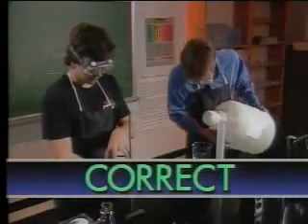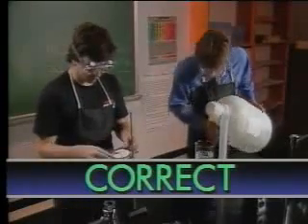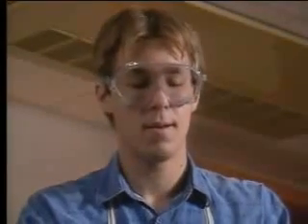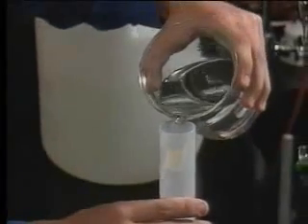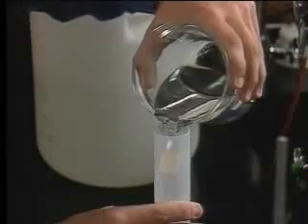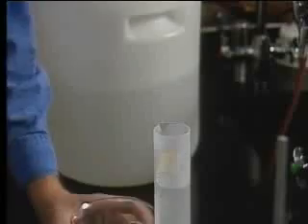Handling chemicals safely means following rules designed to keep them from contacting your skin and eyes, or someone else's. One important safety rule is, always use small containers that you can control easily. Ignoring this rule can cause accidents. If you have an accident, always inform your teacher. Pouring from small containers is far safer.